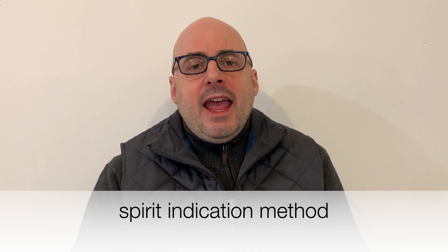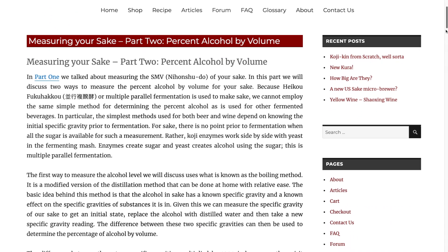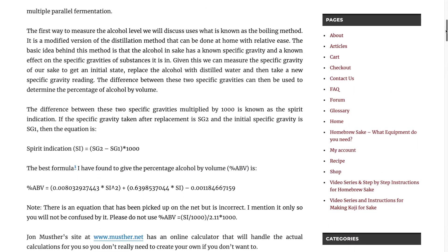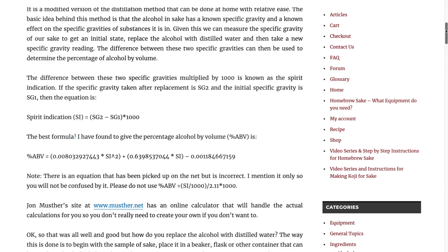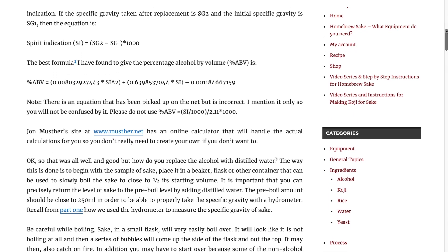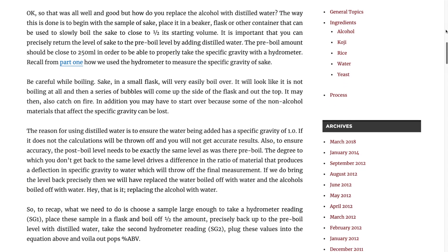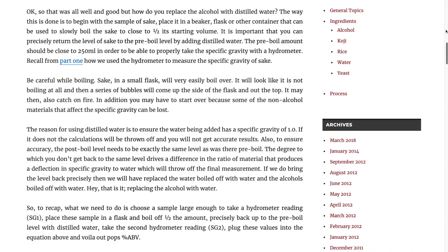Calculating ABV. The method I'm going to talk about today is the spirit indication method. This is a method that involves boiling. I read about this method on homebrewsake.com. It seems reasonable, and hopefully we get an ABV measurement out of this.